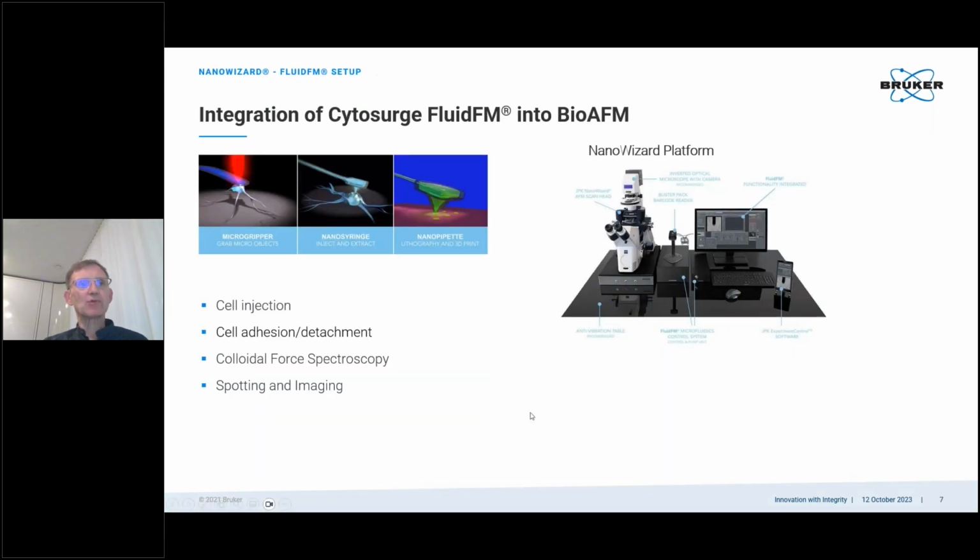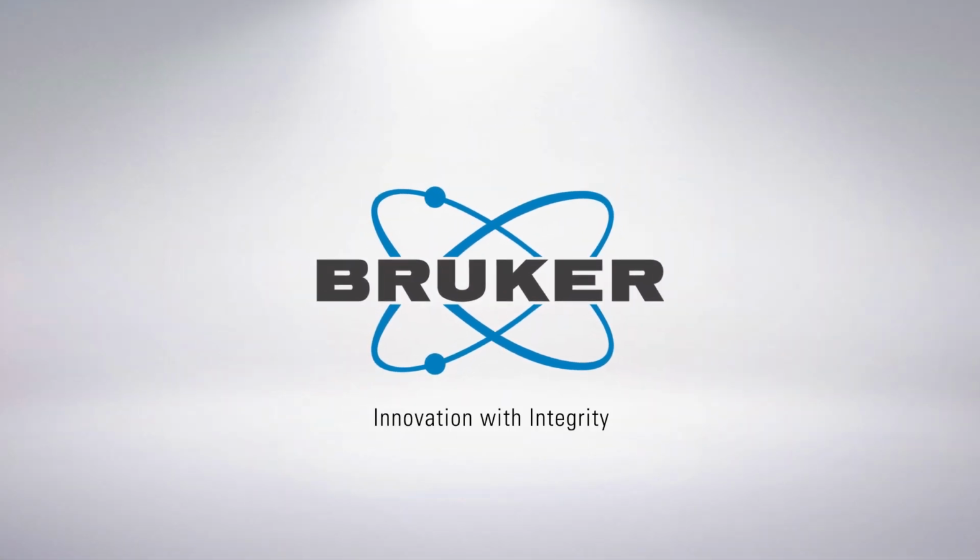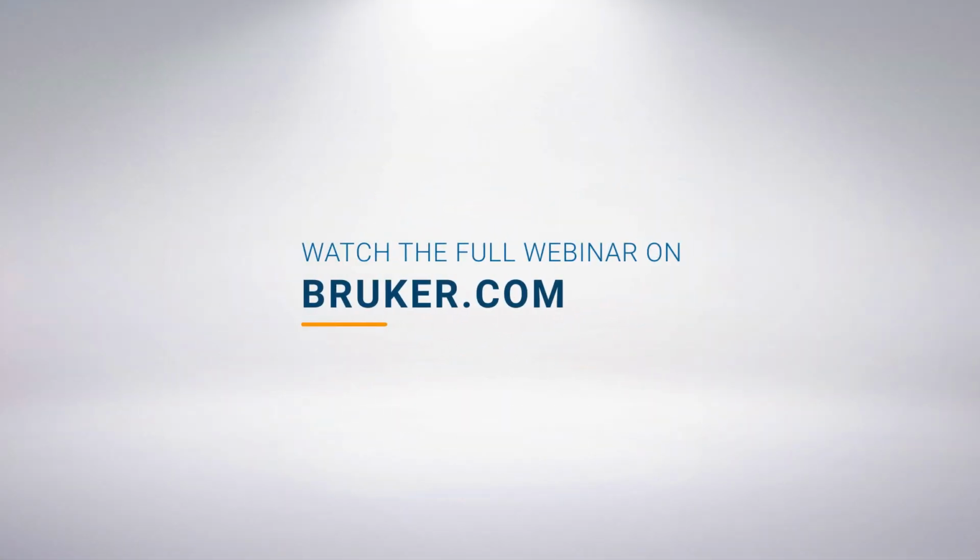Coming to the integration of the Cytosurge FluidFM with a BioAFM, Thomas here has already presented some FluidFM application examples in a wonderful way. Here I would like to recapitulate the 4 main applications. We are supporting cell injection, cell adhesion, colloidal force spectroscopy, and spotting.